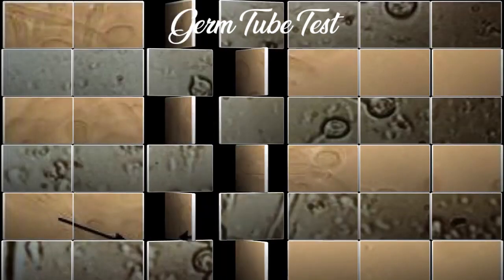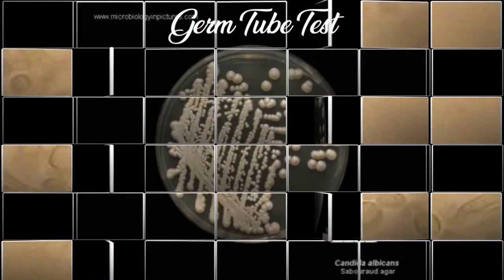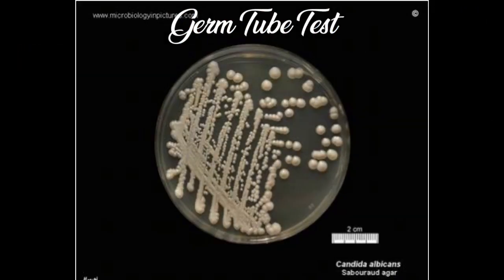When Candida is grown in human or sheep serum at 37 degrees Celsius for 3 hours, they form a germ tube, which can be detected with a wet potassium hydroxide film as filamentous outgrowth extending from yeast cells. It is positive for Candida albicans and Candida dubliniensis. Approximately 95 to 97% of Candida albicans isolated develop germ tubes when incubated in a proteinaceous media.